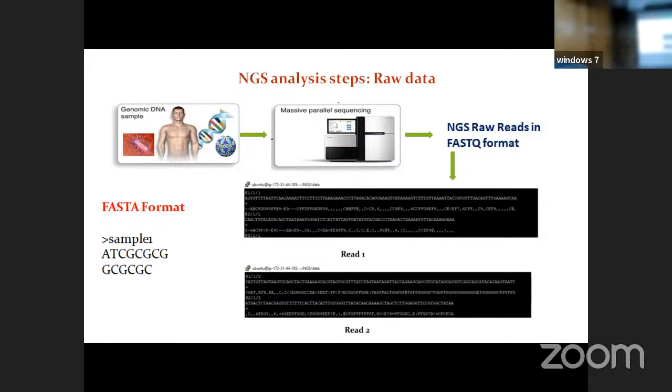You must have downloaded data from GenBank, right? You must be aware of NCBI. In NCBI, there is a database called GenBank, which has the gene sequences. And UniProt is a database for protein sequences. When you are downloading data, it will be in the form of sequences. Which format are they in? Any answer?